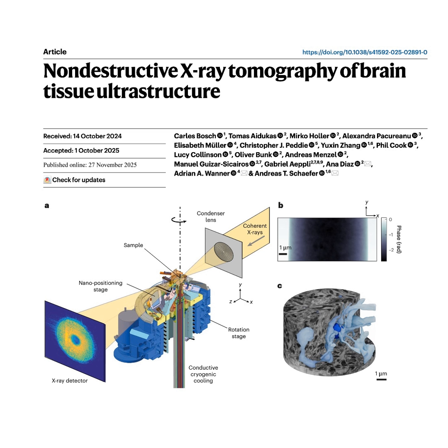Exactly. But for decades, scientists have run into a brick wall trying to do this at any kind of scale. And that wall is really about detail versus destruction, isn't it? It is. To really understand how the brain computes, you need to see things that are smaller than 100 nanometers. So we're talking about mitochondria, membranes, and I guess the most important part, the synapses. The synapses, yes, and communication junctions.